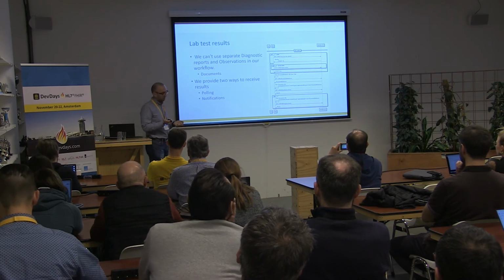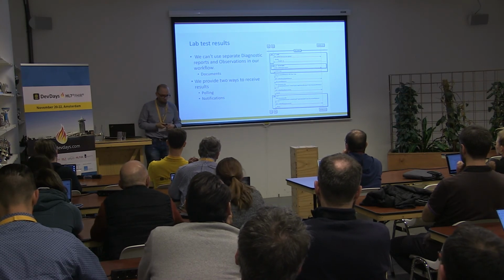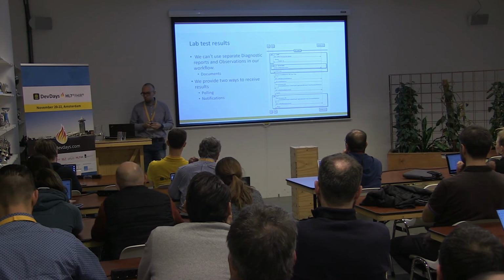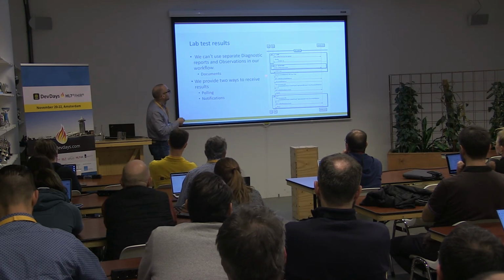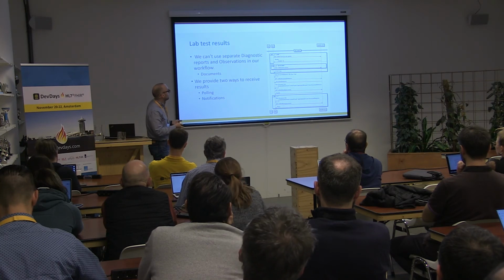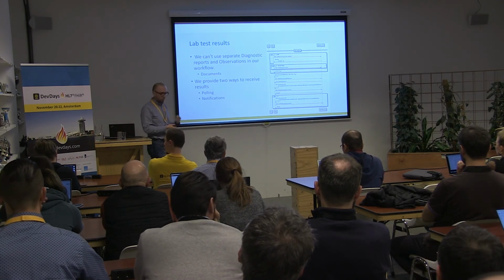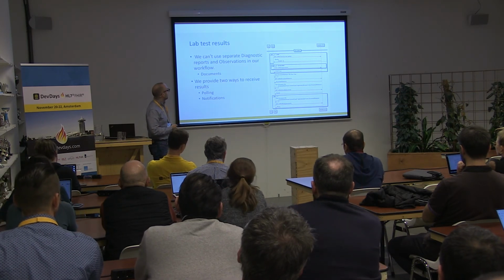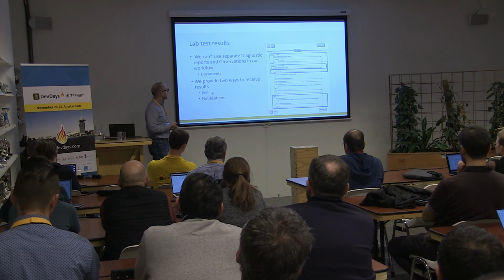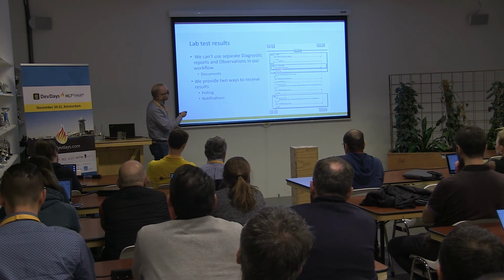Okay, how can our customers receive these documents? First of all, they should find out whether the task was changed or not. It can be done in two ways. First, by polling, when you ask the server all the time whether the task has changed. And the other type is to use notifications. It can be done with subscription.